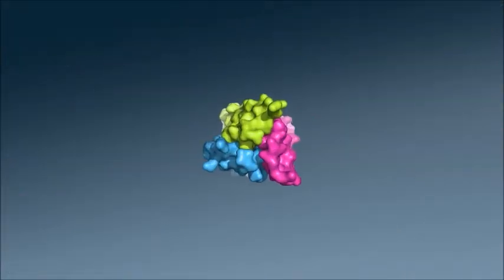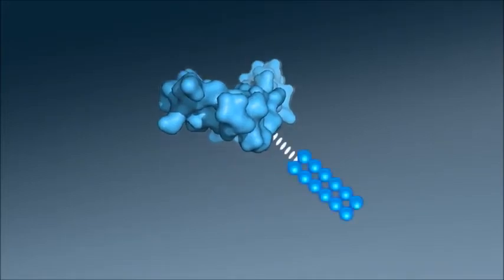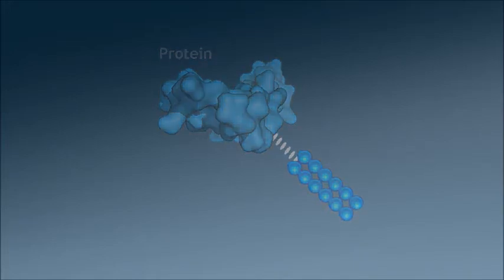Our first step to detect protein-protein interactions is to attach a unique DNA identifier to each protein subunit, called a barcode. The barcode will serve two functions. First, it will be used to amplify single-molecule signals. Second, it will be decoded by DNA sequencing to identify the protein. In principle, we can use DNA to barcode an unlimited number of proteins. The barcoding sequence can be actual protein coding sequences or programmed synthetic sequences. There are many barcoding methods. Let's take a look at two approaches.